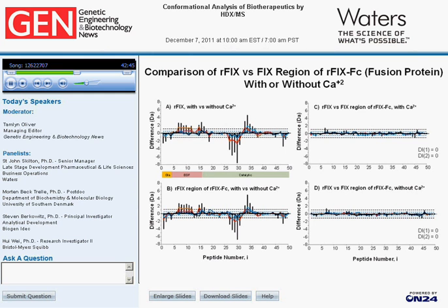Again, we're looking at the comparison of with and without calcium, and you can see qualitatively the pattern of change is very similar, and that's what we would hope. All we're doing is fusing two molecules together, the factor 9 with the Fc, and we're hoping that there's no further changes in that molecule. And this data qualitatively seems to indicate that's actually the case.